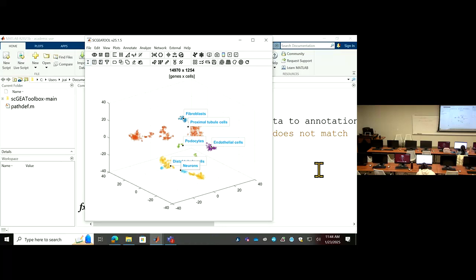Take a screenshot and you can easily fix most of this. It's good. You're done. Did you use the one-click button? You can save this to the method, and then you can save it to the hard drive.